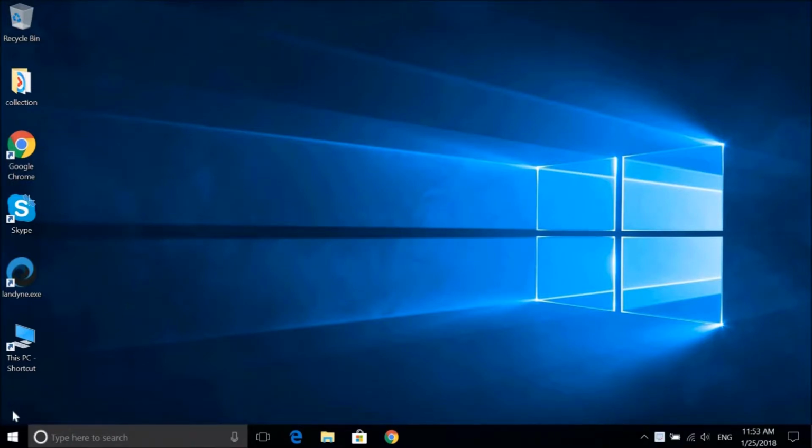We already showed the installation of the Landyne suite together with the Java runtime environment and the Java Advanced Imaging in the first video of the series. You can find it on YouTube by searching for Landyne plus Launcher.